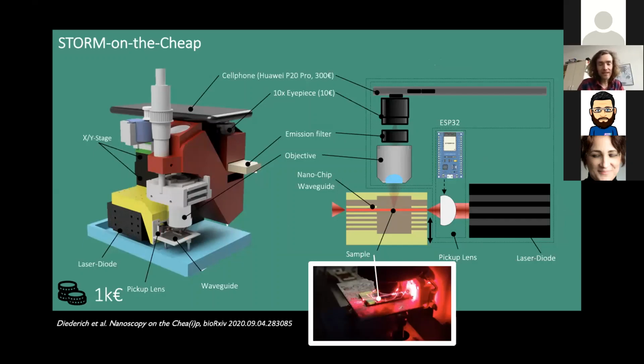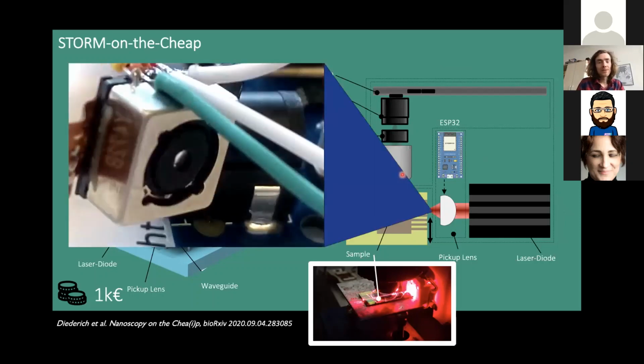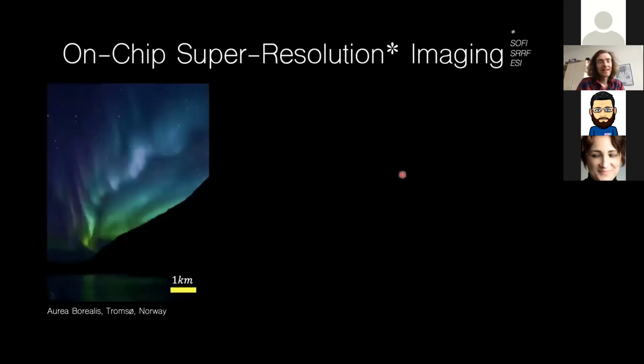And you see here this line here, that's basically the coupled light. The coupling efficiency is surprisingly good, and you can tune it, like as I said, in the 20 to 50 nanometer range with some very simple electronics here. And so, just showing that again. And the first thing, well, dSTORM is of course quite sensitive to intensity. So we started with something else.